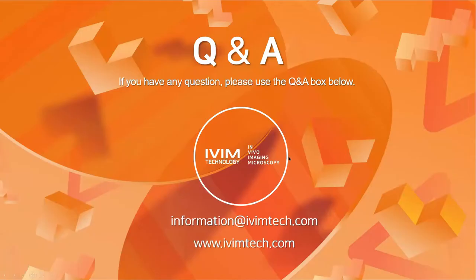Okay, thank you very much. So if you have any question, I can answer you now. So first of all, I can see one question in the Q&A box. It's a question from Ralph. Can you explain a little more about how the motion compensation works? Is it computational image registration or is the stage microscope moving with the animal?